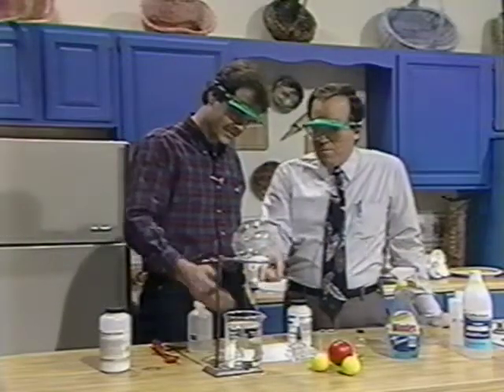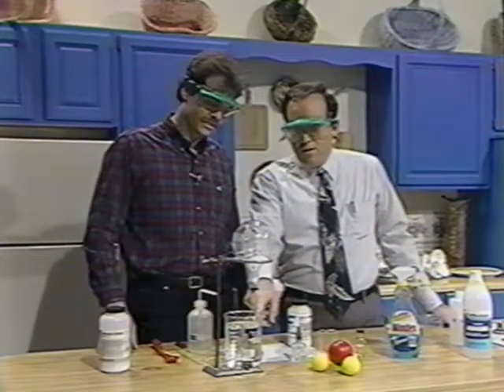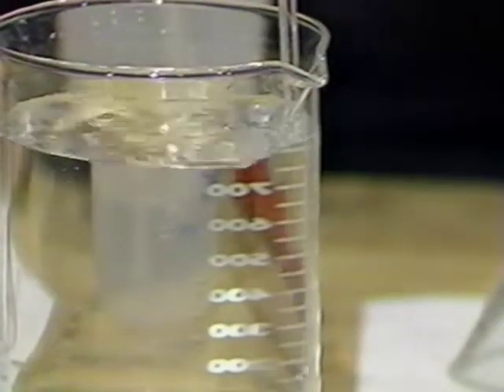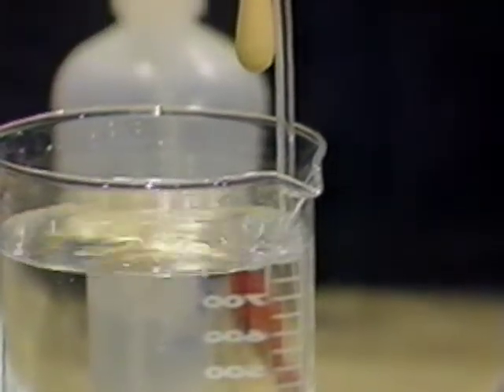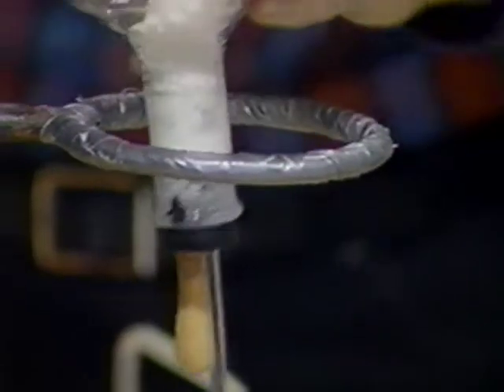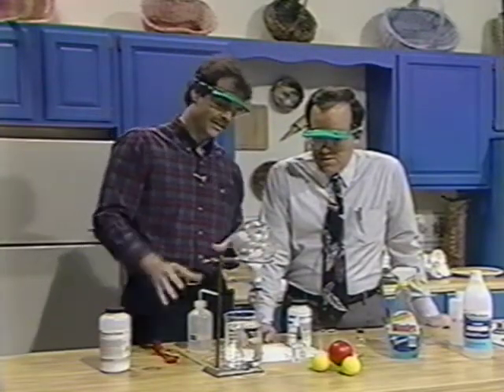Hopefully we'll see bubbles. Right now those are mostly air bubbles because the flask is filled with air. But the reaction is generating ammonia gas, and so the ammonia gas is forcing the air out — expanding in there and pushing the air out. I'm a little disappointed it's bubbling so slowly; maybe I haven't got it mixed up really well. We'll let that go a few minutes.